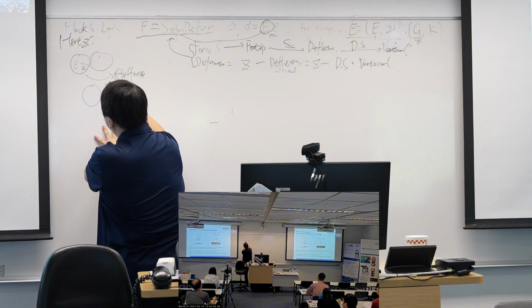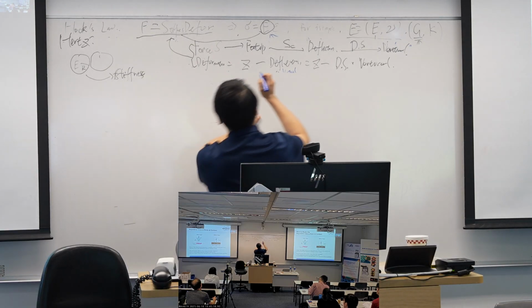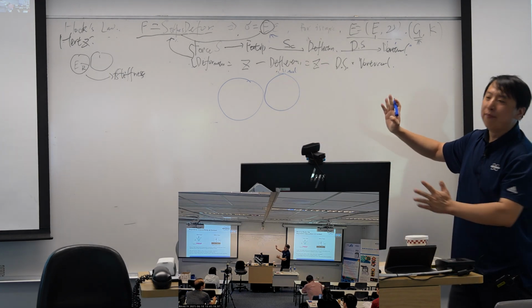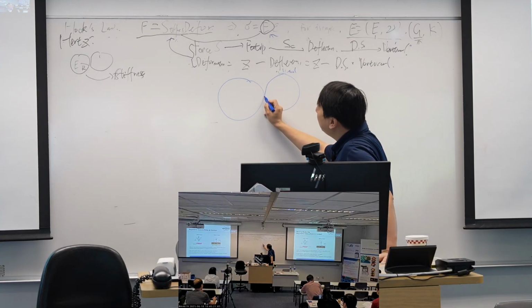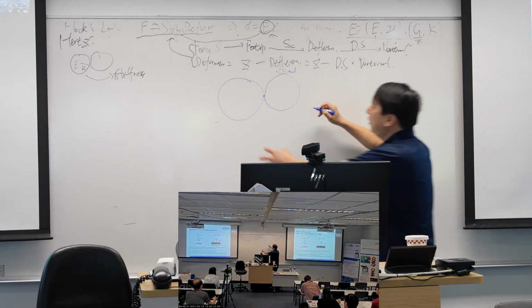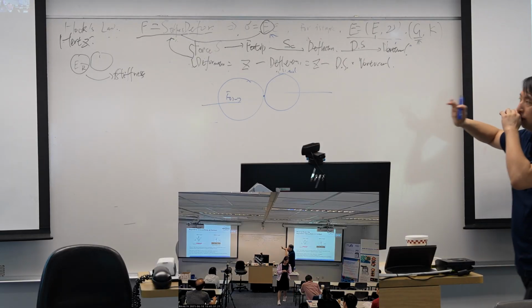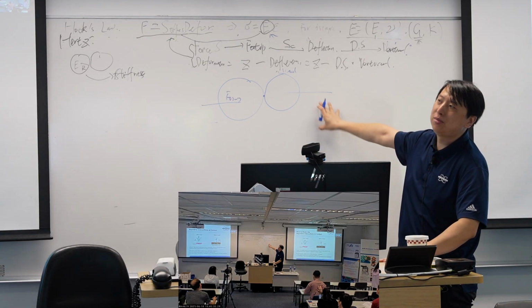I have one sphere, two spheres, I'm sorry. I draw down here, I have two spheres. At the beginning, there is no force between each other, so the contact point is just one point. And then when you use force to squeeze them, it is our classic compression experiment.